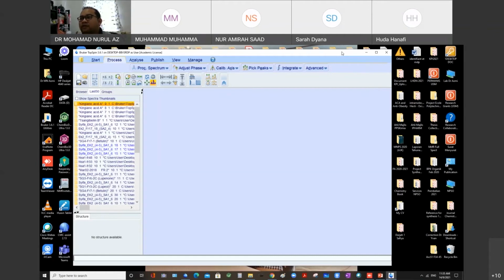We cannot see the C=O peak of the carboxylic acid, but we can see the contour in COOH. So we just read that NMR and take the carbon value from there. Okay, I will pick that question and I will show it in my NMR for the HMBC and HSQC discussion.